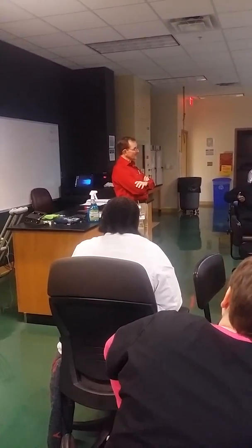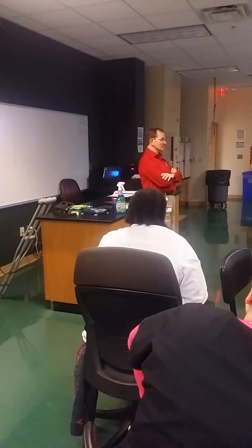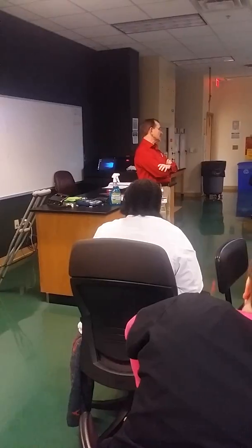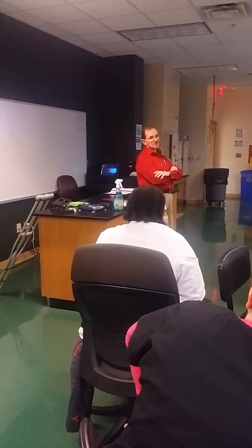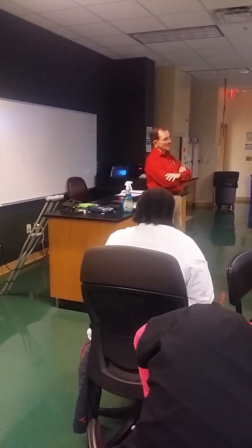If you use too many plates, what am I talking about? I'm talking about being careless. You should, at this point in time, you should not be gouging either. You should know enough. That was understandable the first day, but come on, guys. You can't use 100 TSA plates.